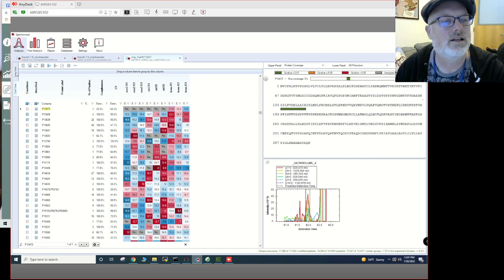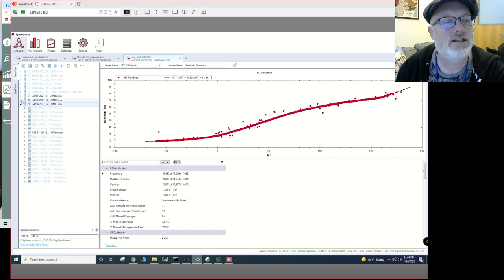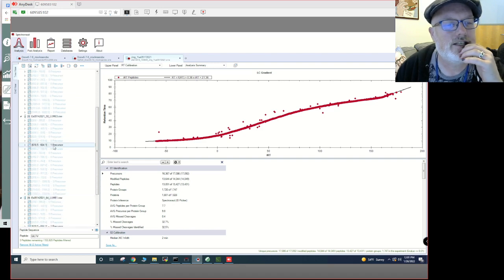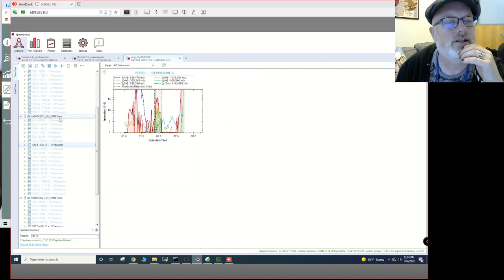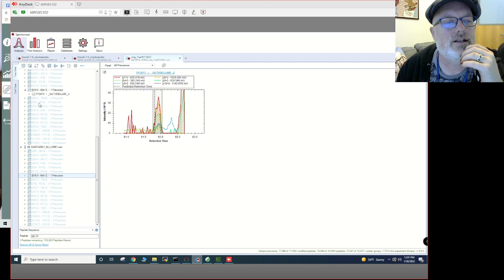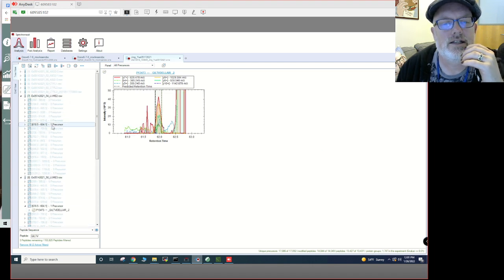GILTV. And why is that not? There we go. GIL. I don't know why I did that before, but now it's all in each one of our runs, and we can see it here. There it is in that one. And there it is in that one. And there it is in that one.